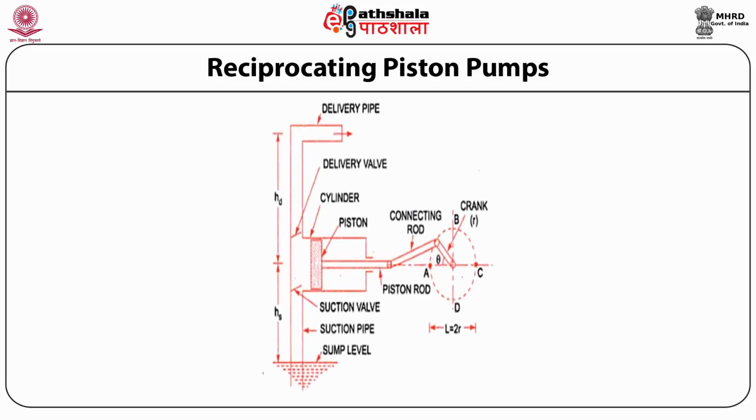Another type of pumps are reciprocating piston pumps. In these pumps, through reciprocating motion of a piston within a hydraulic chamber, a motor electrically drives the piston back and forth. During the backward stroke, the piston sucks in the solvent from the reservoir, and during the forward stroke, it delivers the solvent into the column. The check valves are enabled that close the column outlet while aspirating the solvent in backward stroke and close inlet from the reservoir during forward stroke.